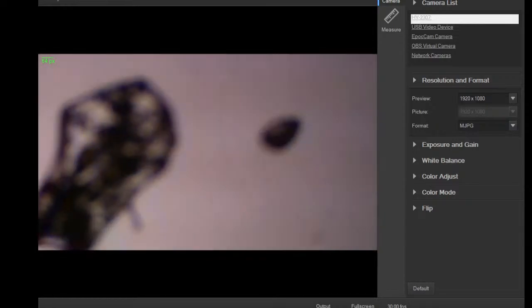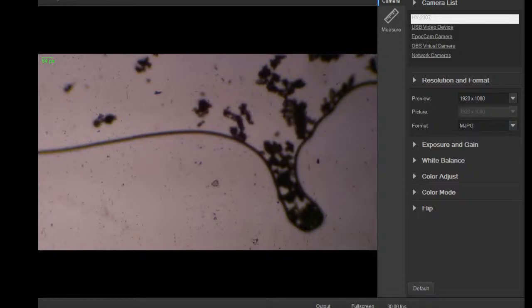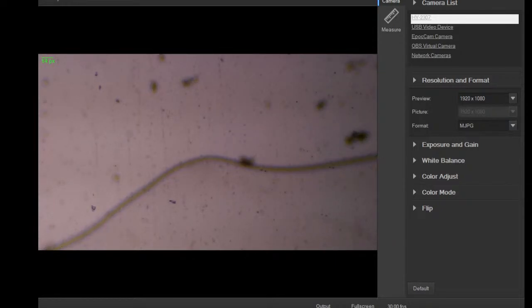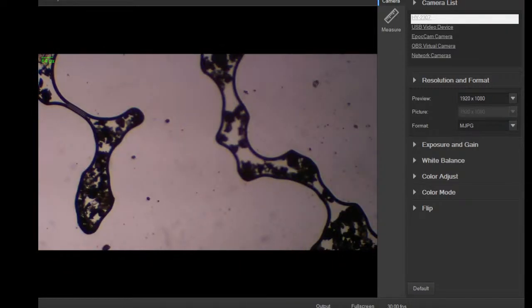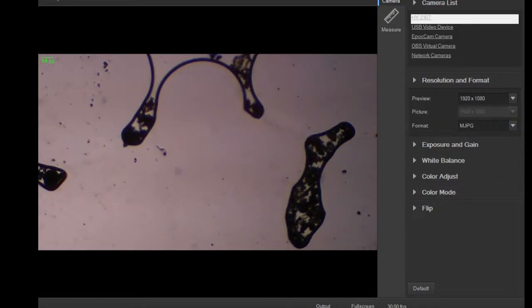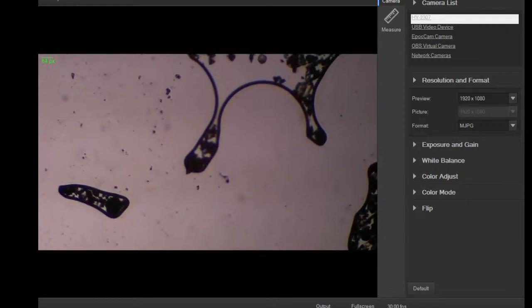If you missed the other part, David, I have these water samples I got from basically a gutter outside from all the rains. And just looking at what's wet in here. Well, you can already see the waterfront moving on that one. I think I got water on top of the slide, which is why you get that weird formation. Shouldn't do that under a cover slip. It's kind of cool though to watch it. See little segments disconnect and reform as they touch.